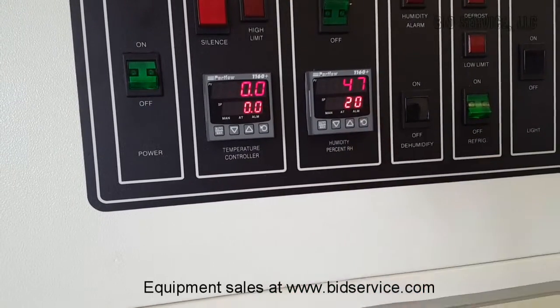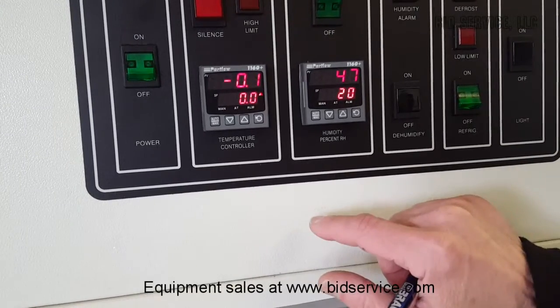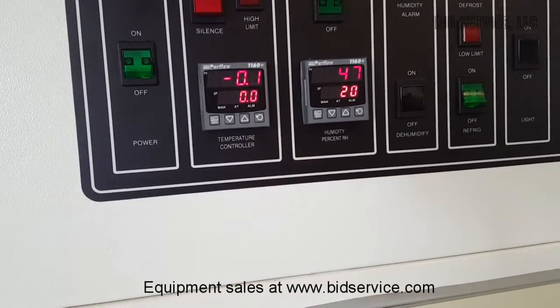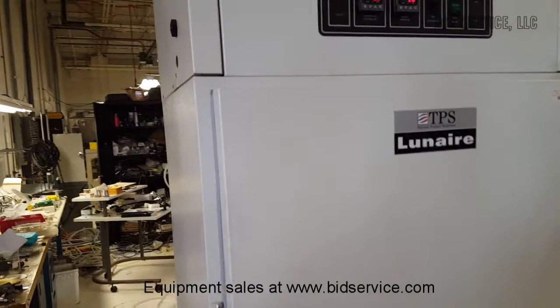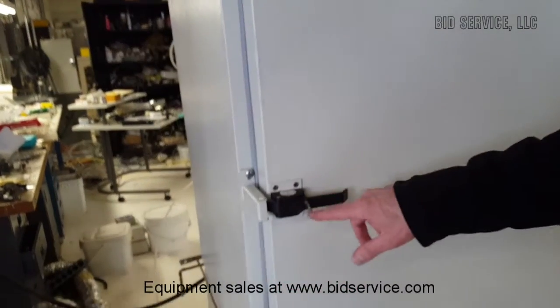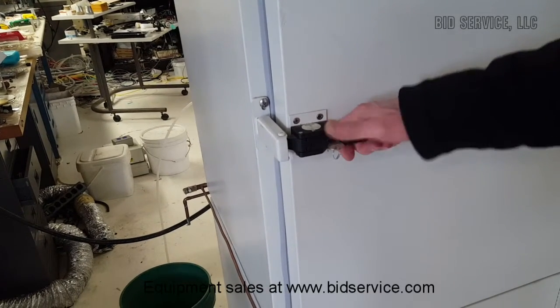The humidity is reading 47 right now. So what I'll do is let's take a look inside first — we'll open this up. We do have a key; you can lock this door and remove the key if necessary, and we'll send that key along.